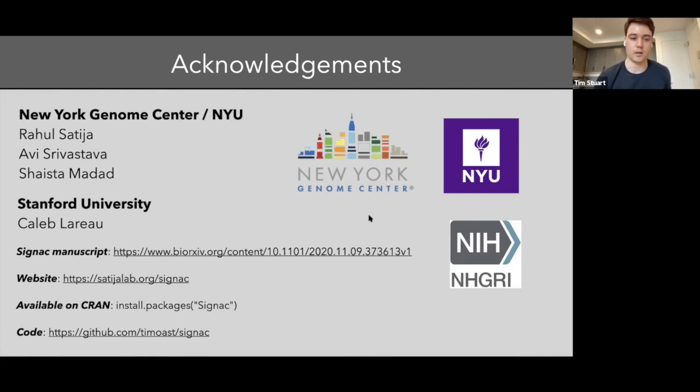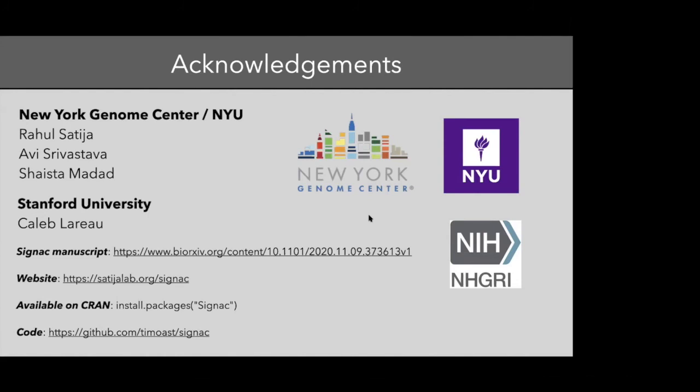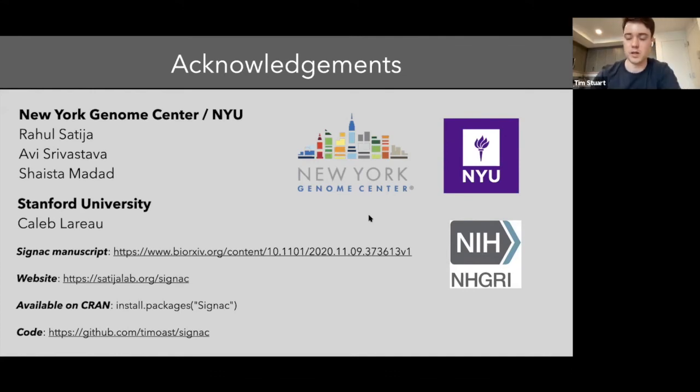And then, sorry, what was the second part of your question? The SCTransform. Right, yeah, so we definitely don't recommend running SCTransform on the scATAC-seq data. SCTransform was really developed for count data that follows a negative binomial distribution, which is not really true for scATAC-seq. So for scATAC-seq, if you want to go down the path of running LSI, you can do the TF-IDF transformation instead.